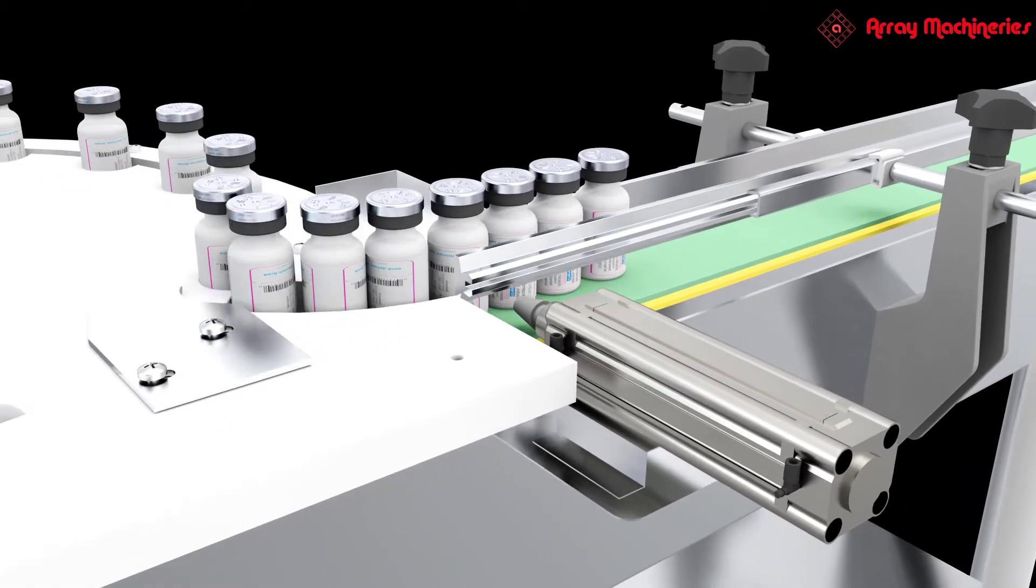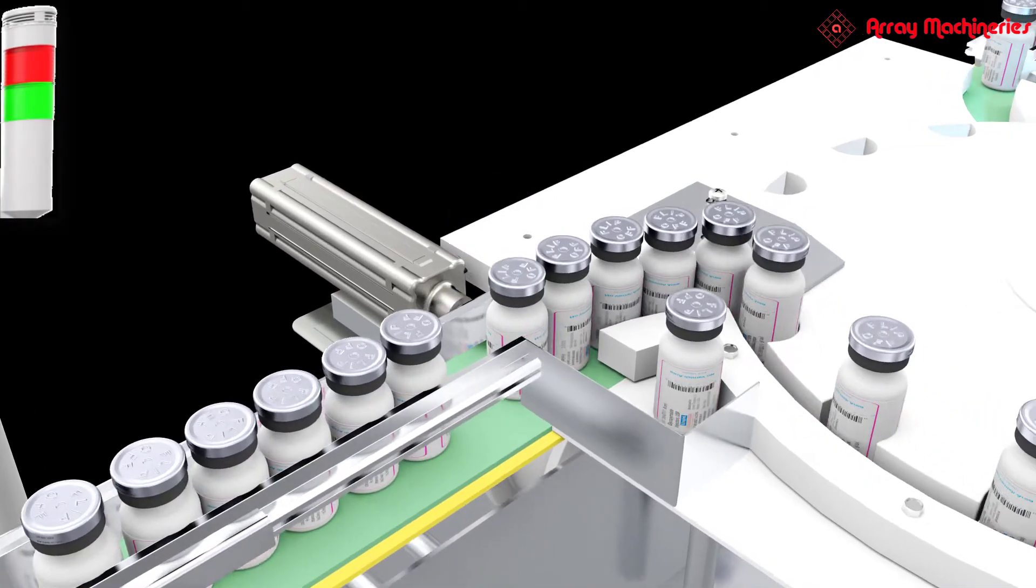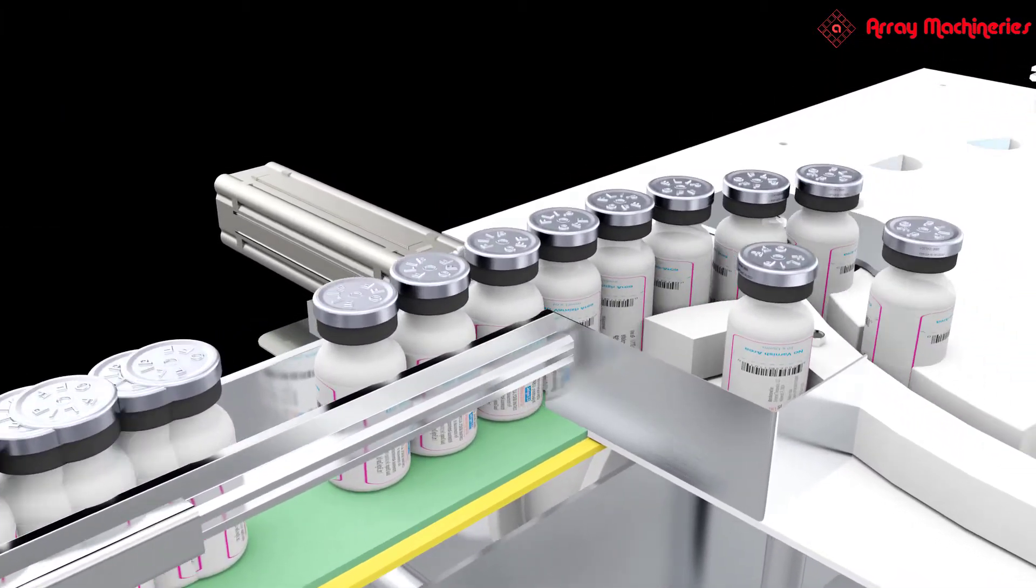If due to any reason prints got missed, it sends a signal to the rejector. A pusher type rejector rejects the unprinted vial. The rest of the vials are conveyed to the vial collating station.